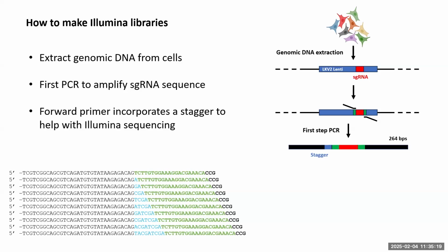What you want to create is complexity in the initial steps of the sequencing. What this does is means you've got a pool where the guide sequence may be all the same and the primers all the same where it's reading, but it starts reading at different points. And so at least 1 in 10 of them have an A or a G or so forth, along the way. So it's essentially to make the sequencing more efficient.